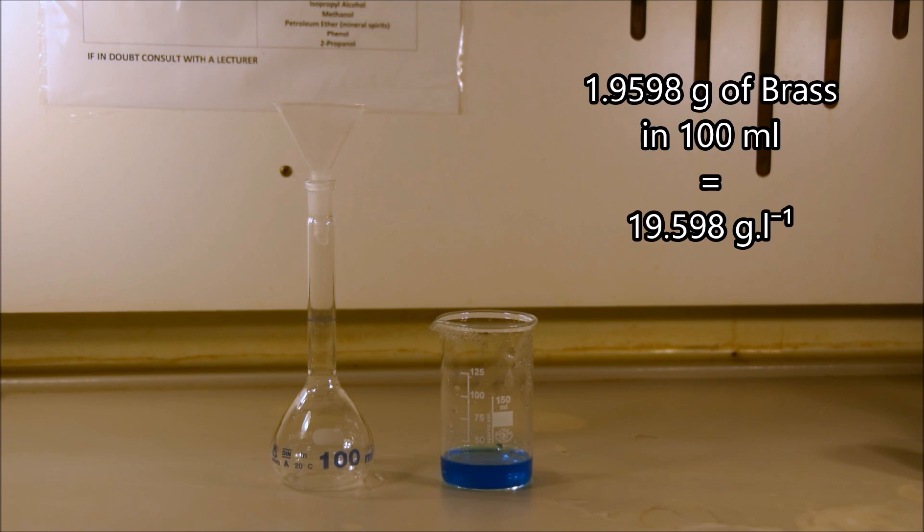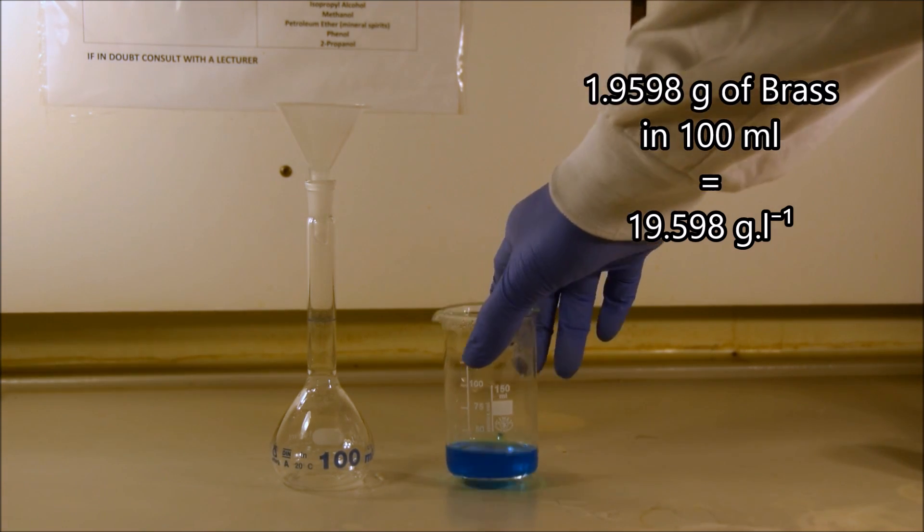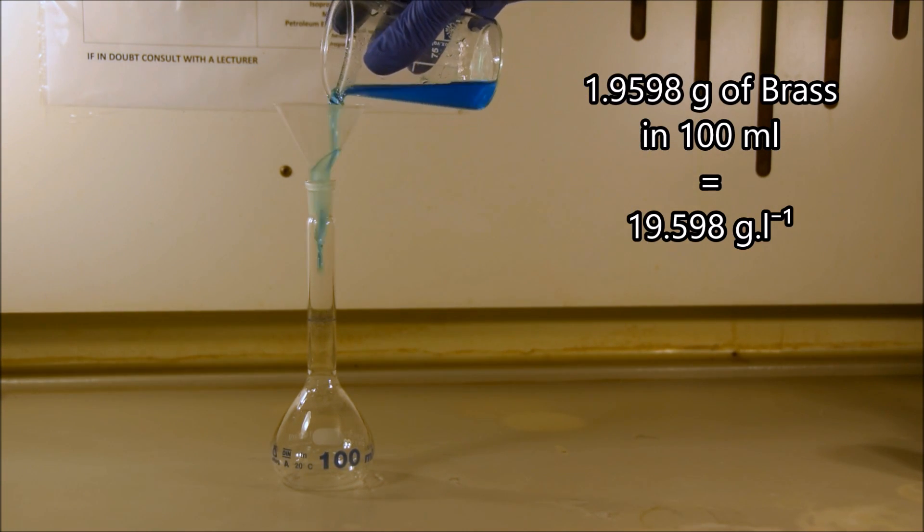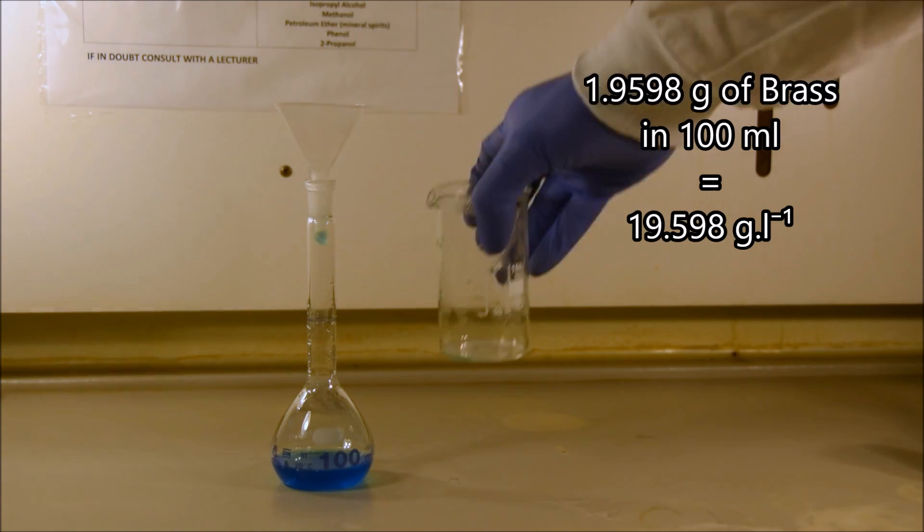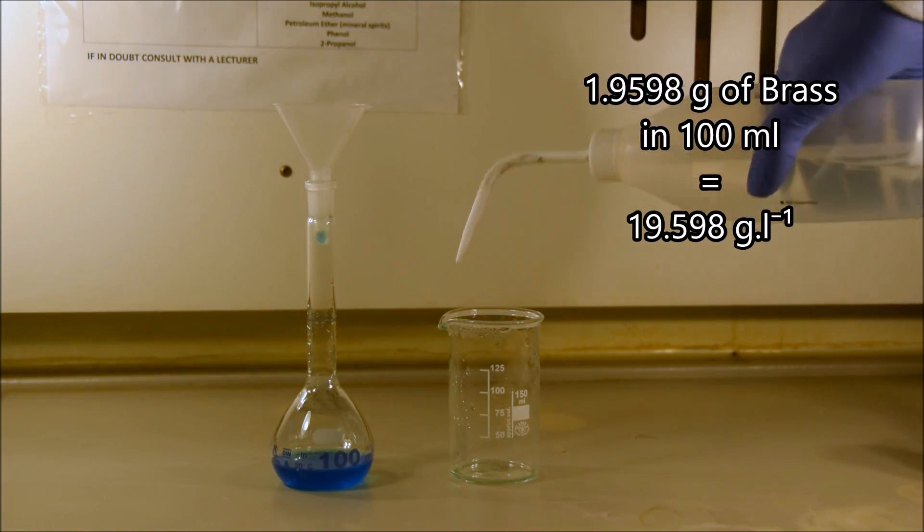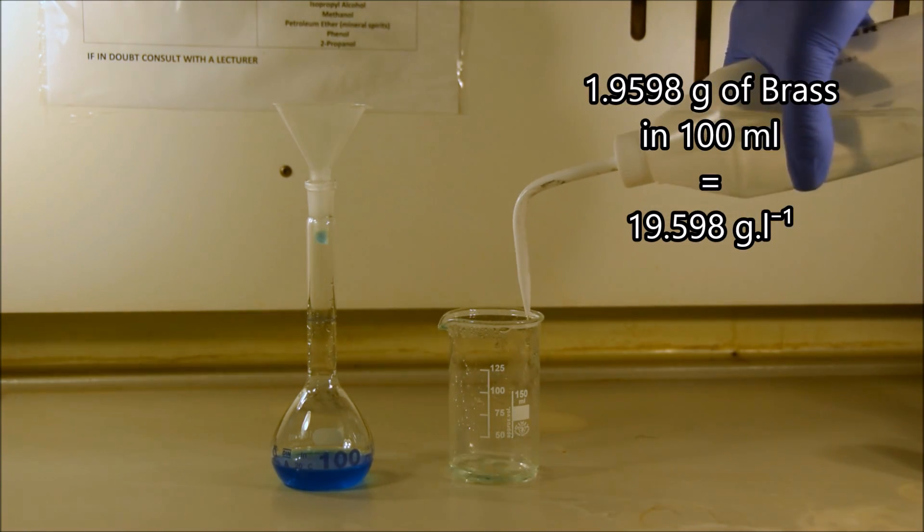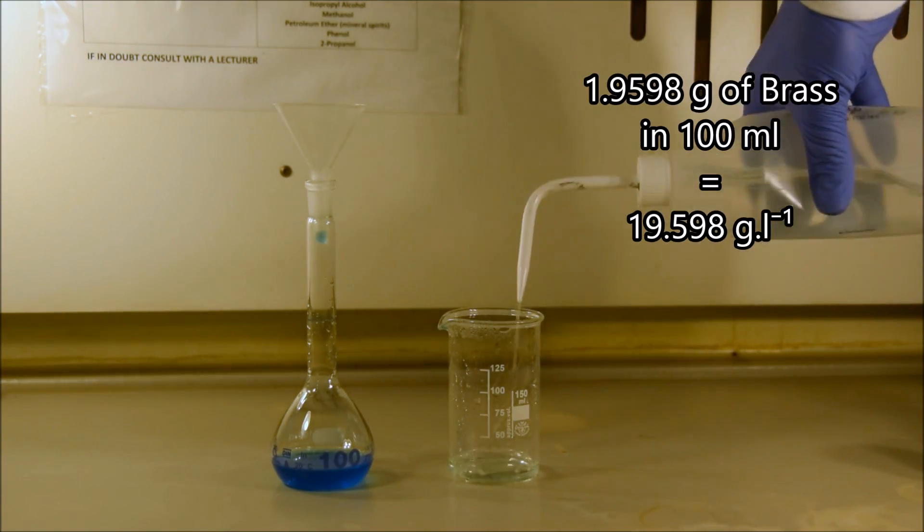So to do that we use a volumetric flask. In this case we're going to use a 100 milliliter volumetric flask, which means if we take our 1.9598 grams of brass and dissolve it in 100 milliliters of water, that's the equivalent of having 19.598 grams in 1 liter of water. We'll come back to why that's important later in this experiment.